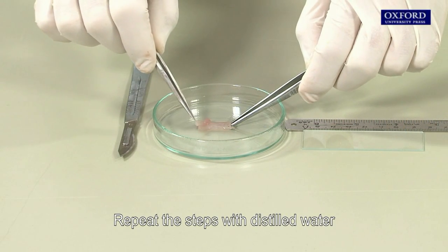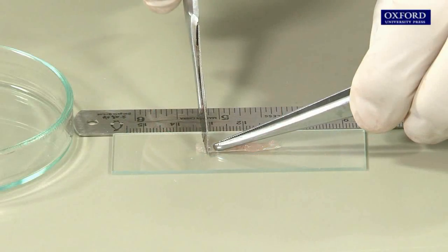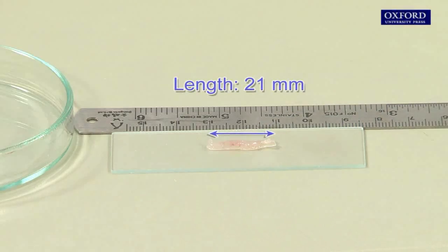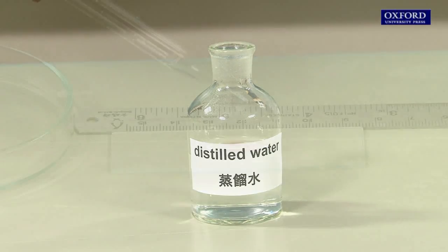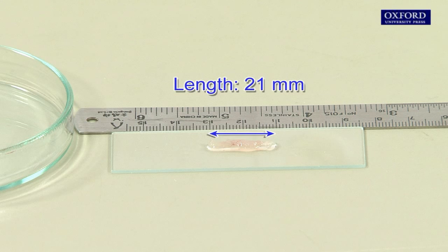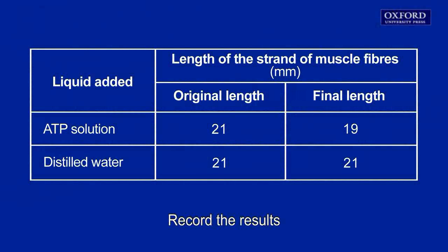Repeat the steps with distilled water instead of ATP solution. Record the results.